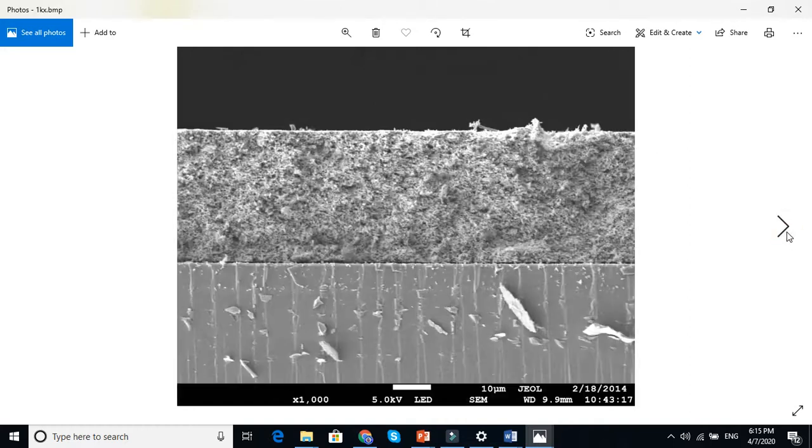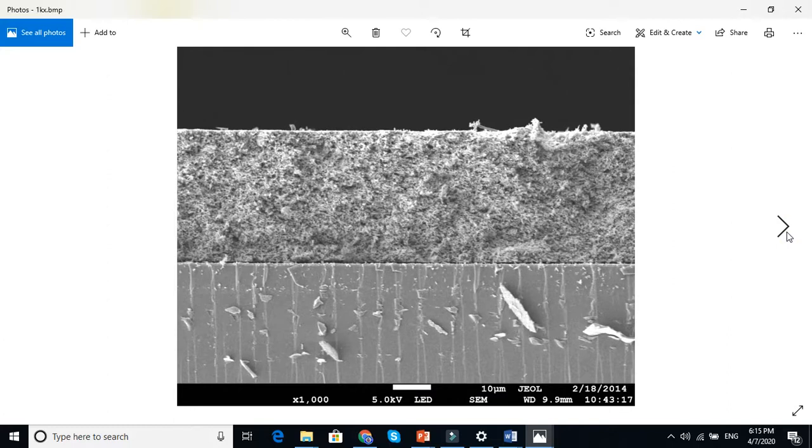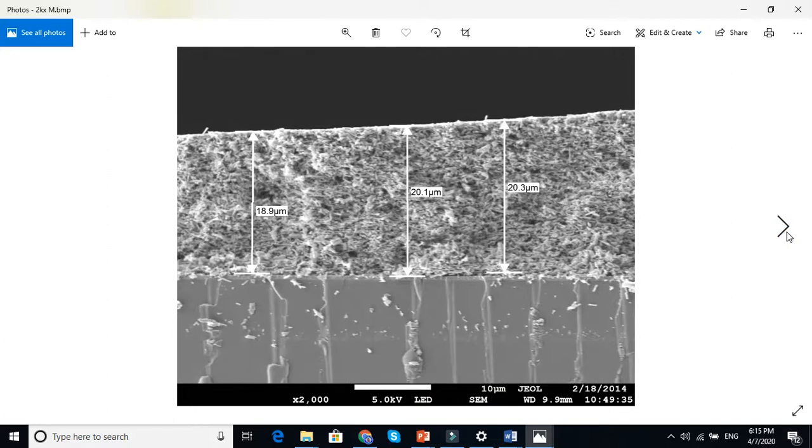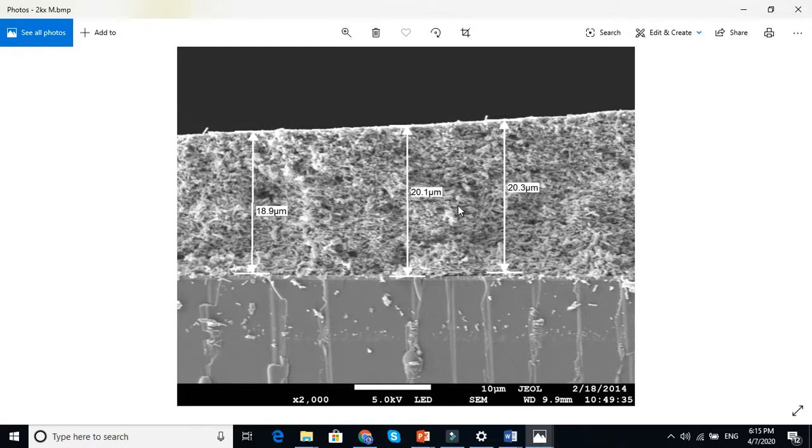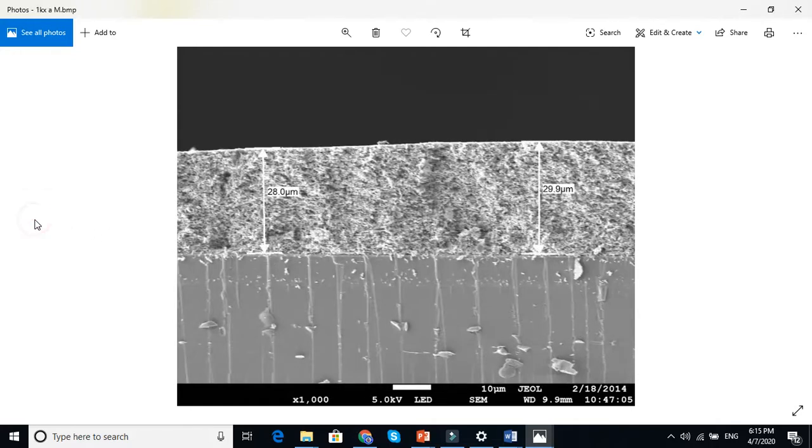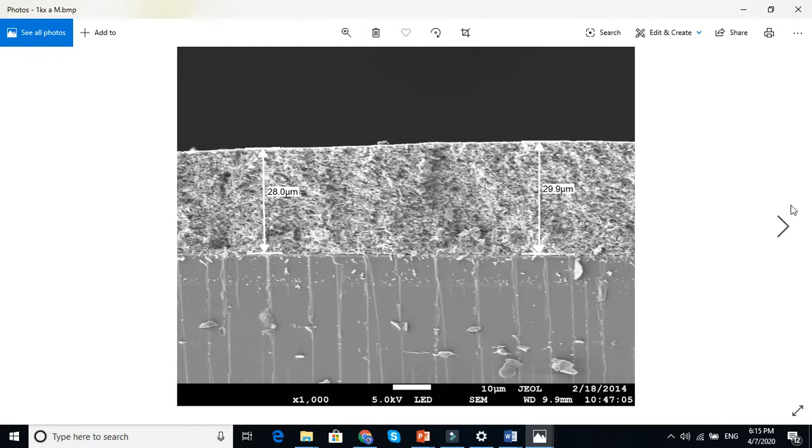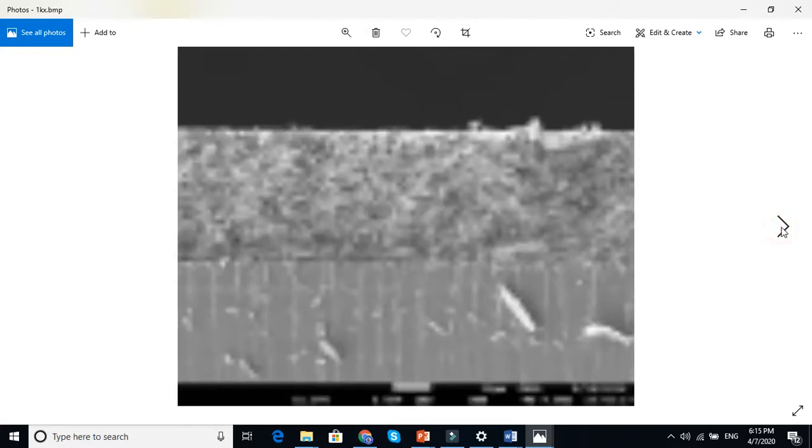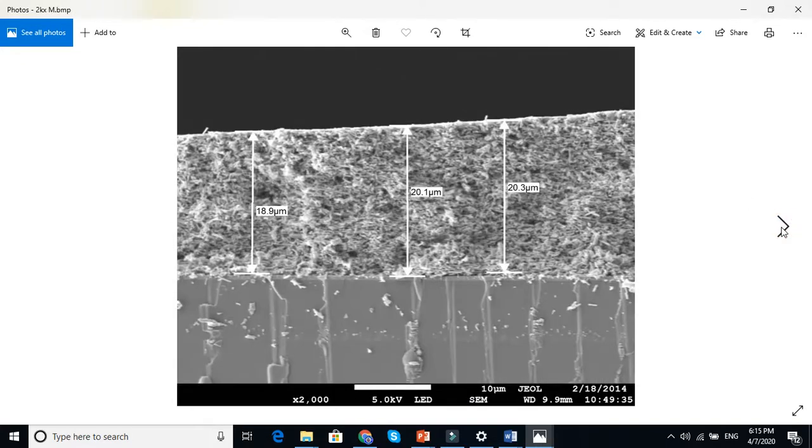Now let's zoom and further zoom it here. Here the thickness is increasing. Now I told you that you get a lot of information. Now this thickness in previous was almost about 10 micron, 20 micron here, and 29 micron here. But if you look into here, so it is decreasing tremendously.